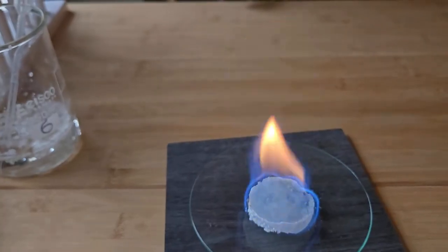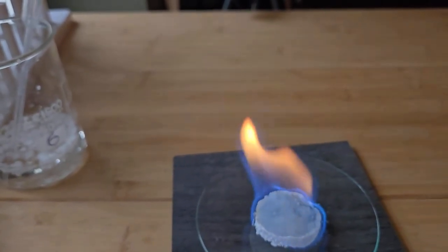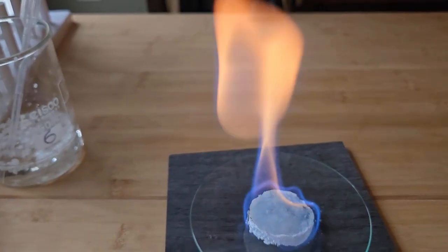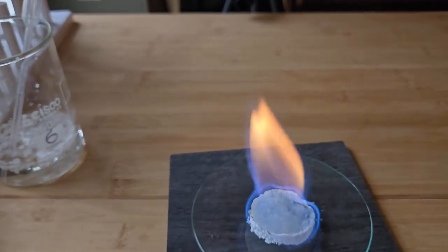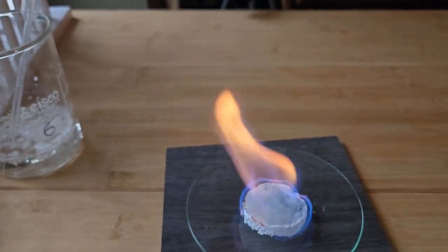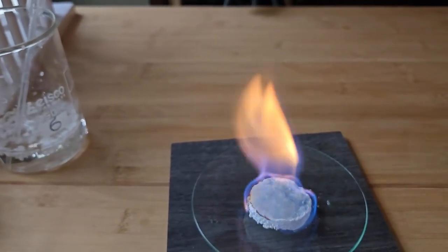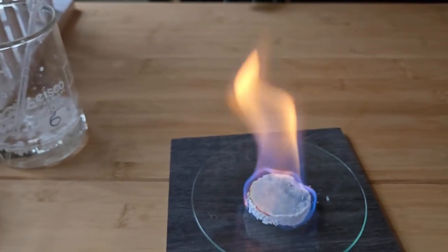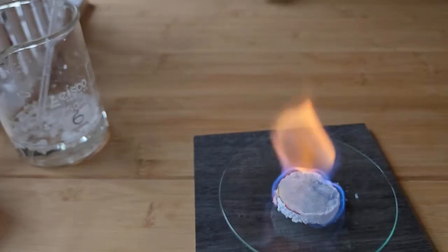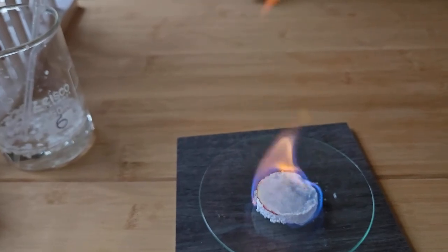What happens is the alcohol and the calcium acetate combine, forming this gel, and then the gel can be set alight and provide a heat source or candlelight atmosphere. And these gels can last quite some time, and that's why they are used as a form of fuel source. You can actually buy home fires using gel fuel, and this is demonstrating that principle.